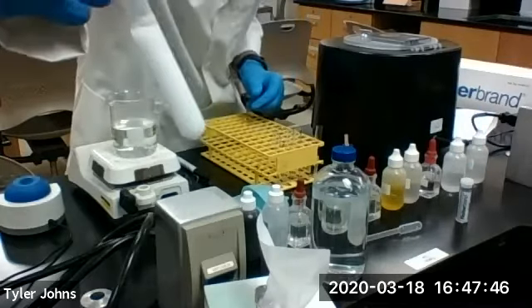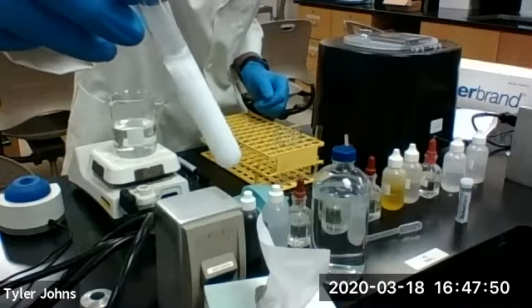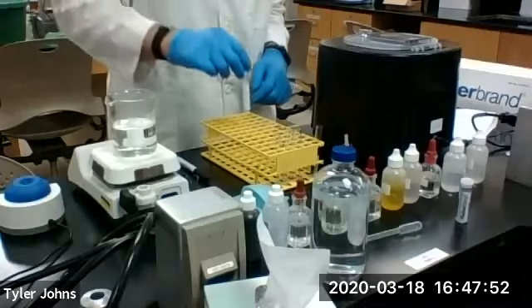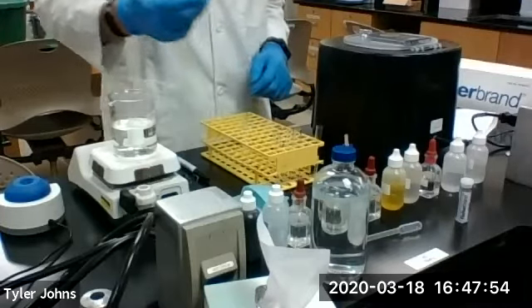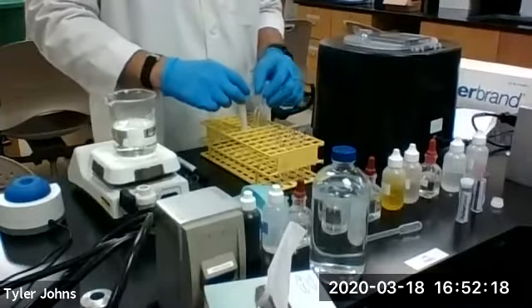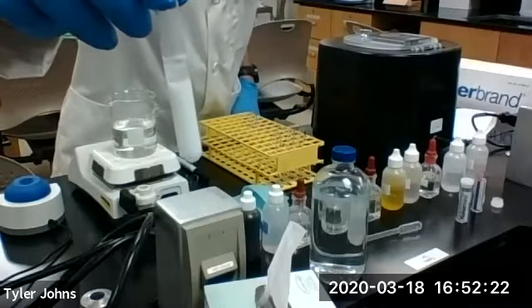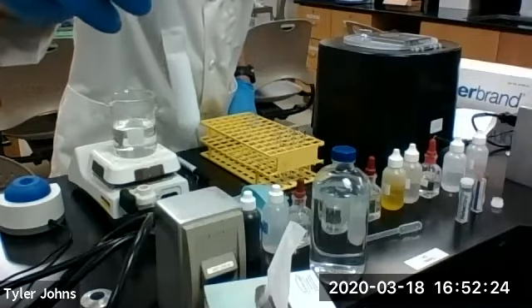Now you can see how much precipitate we have. We're going to let this stand for 5 minutes. Now after 5 minutes, we've let the precipitation complete, and we're going to centrifuge.